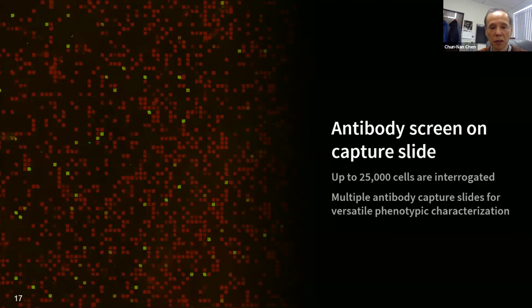And in terms of the capacity, we will screen up to 25,000 cells that could get interrogated on a particular run here. So we're able to look at these multiple binding profiles with phenotypic characterization, as I mentioned before, using SimoScreen or SURF screen.